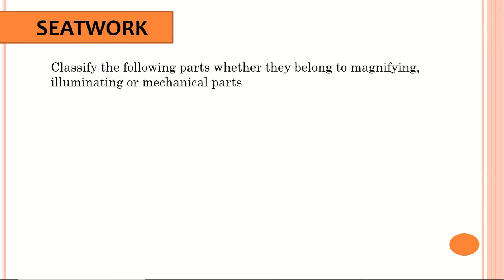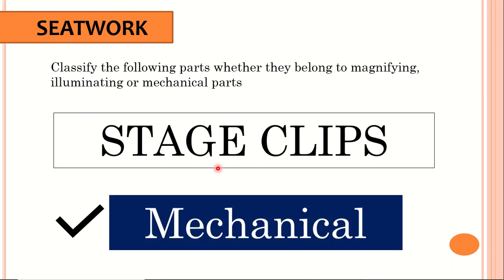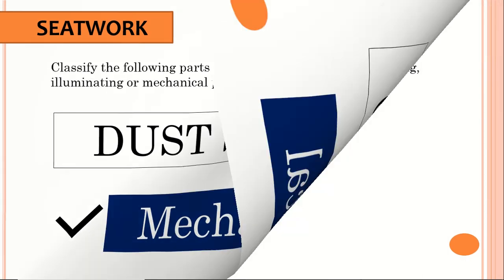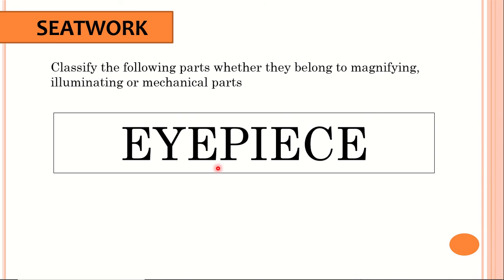Next, stage clips. What is your answer? Very good. The answer is mechanical. Next, dust shield. What is your answer? Very good. The answer is mechanical. Next, eyepiece. What is your answer? Very good.